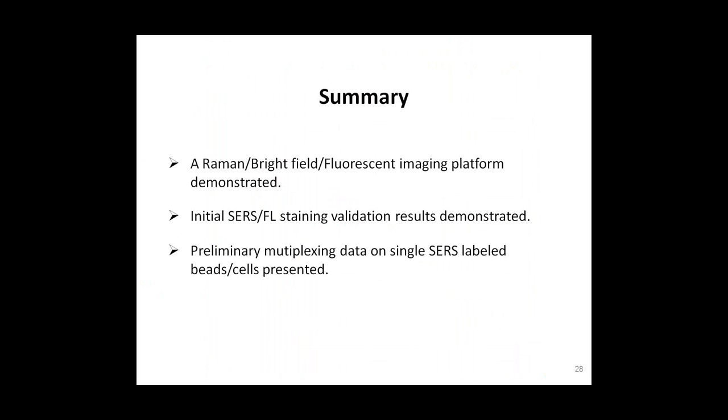So in summary, here we have demonstrated a multimodal imaging system to perform Raman, bright field, and fluorescent imaging. And we have demonstrated our SERS and fluorescent staining validation results, as well as our preliminary multiplexing data using the software tools from CellProfiler and FCS Express.